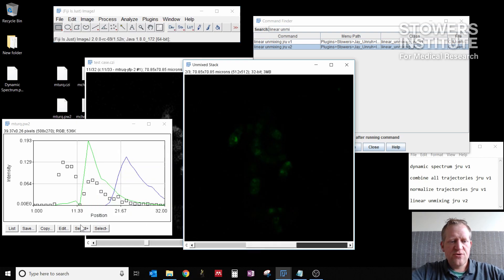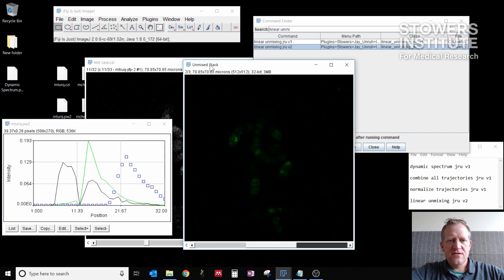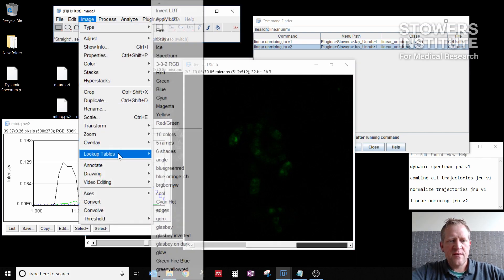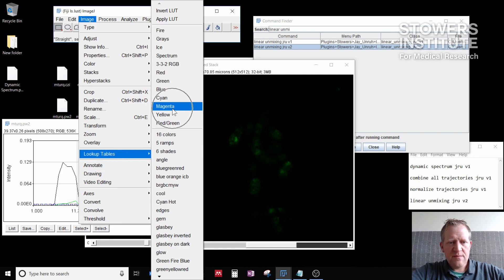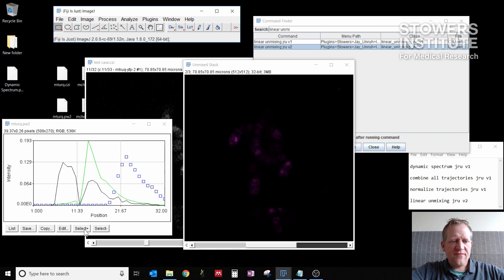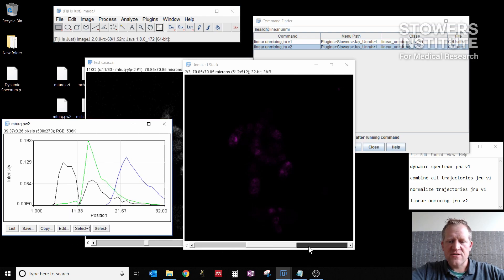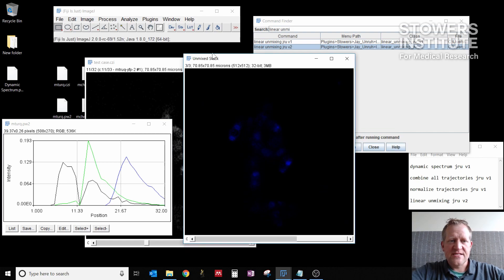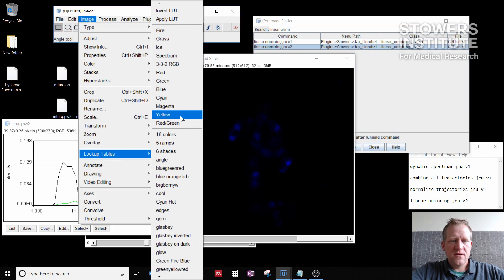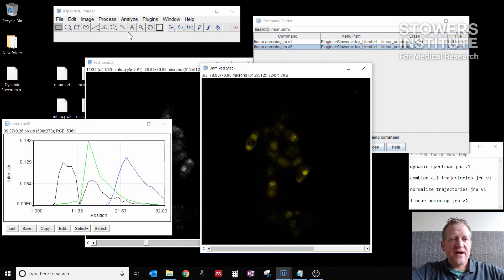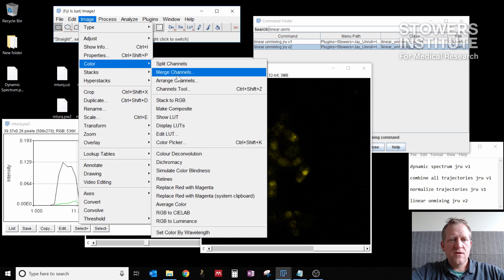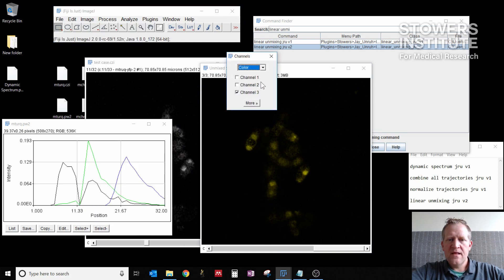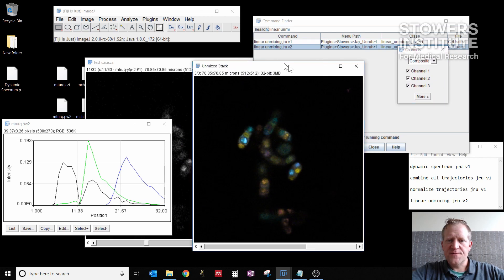Channel two then, if I click select plus again, is the mCherry. So I want to change that to magenta, image, lookup tables, magenta. And then if I click select plus one more time, YFP is the last channel. So if I go to the last channel here, I can make this yellow. Image, lookup tables, yellow. And then finally, if I go to image, color, channels tool, I can make a composite here that shows all three colors.